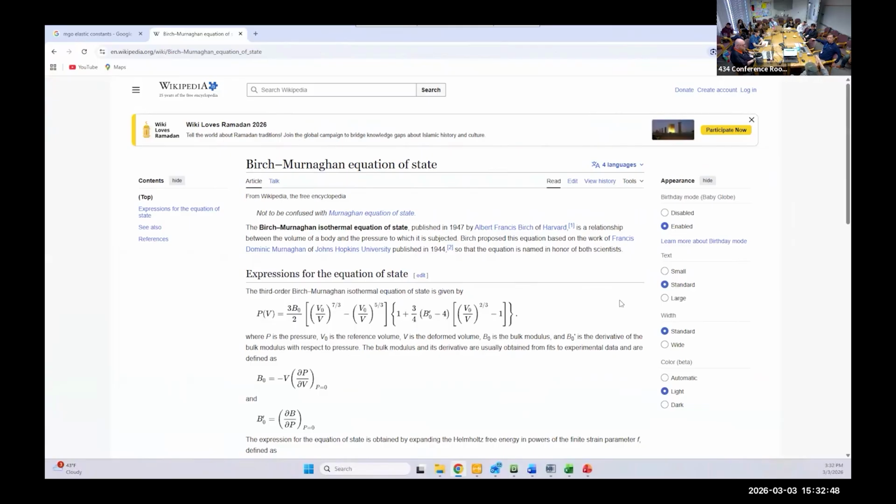But when we add the component of temperature and say, if it was just at high temperature, what would the pressure be? Because you get thermal pressure. So it's like you add the component from the pressure and the component from the temperature. This is why the JCPDS files have this thermal expansion term in it. Because of the crosstalk between those two parameters, you need to know one. Otherwise, you can put any combination in there, it'll fit, but it's not really precise.